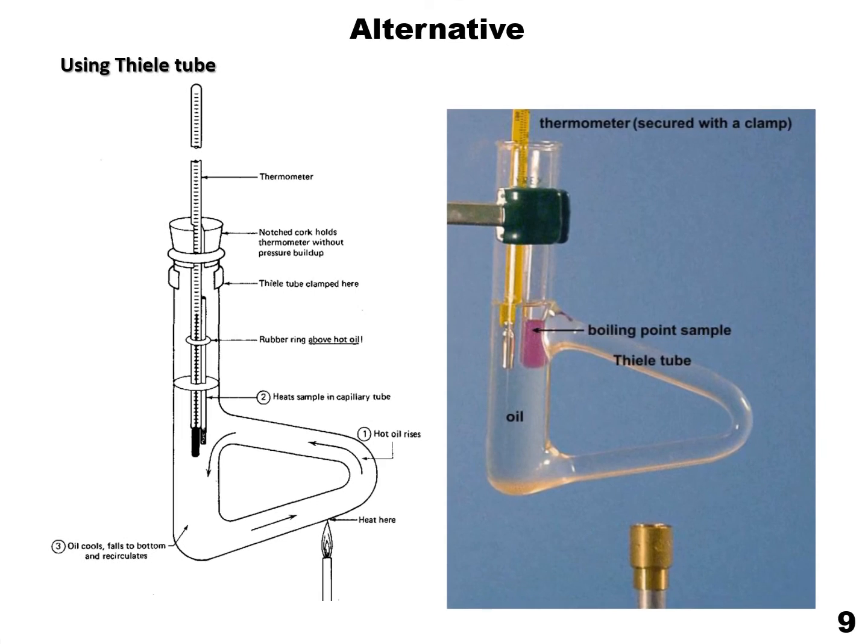The way you tie the capillary tube with the thermometer and everything is almost similar, but using the Thiele tube is safer and more efficient than using just a test tube, because even if you see the heat source, the Bunsen burner is placed at the arm of the Thiele tube, which means there's no direct heat going into the sample, which would give us preliminary results and deform the sample before the actual temperature has been reached.